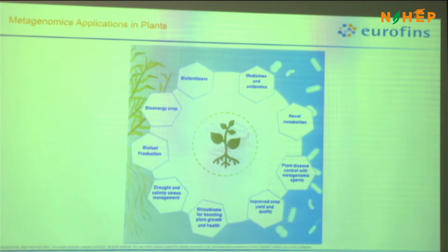And these are quick processes because we just extract the DNA and go ahead. If you are doing it with RT-PCR, you have to design that particular primer. If it is an unknown one, you don't know what to do with it; you will sit, design, decide the primers, and then one after the other test the RT-PCR and then identify. Here we can just take out the DNA and sequence it.